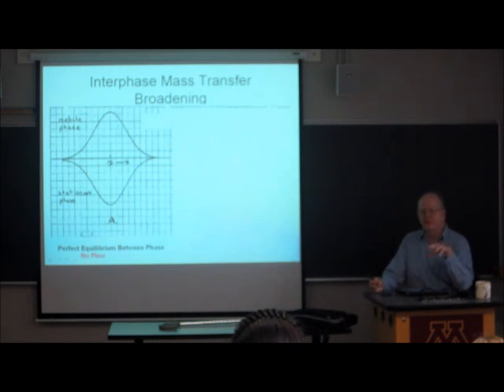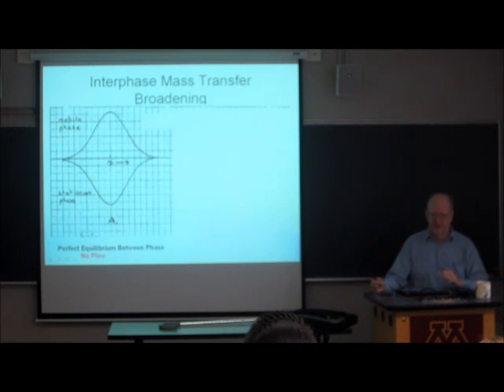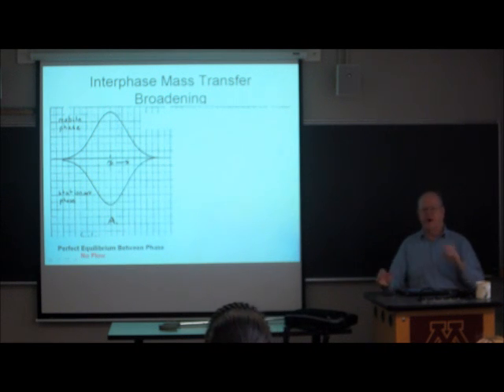But I haven't attached a physical meaning to A, B, or C. One of the processes we believe is very important in establishing the HETP is the transfer of the solute between phases, from the mobile phase to the stationary phase, through the stationary phase, back out of the stationary phase into the mobile phase.